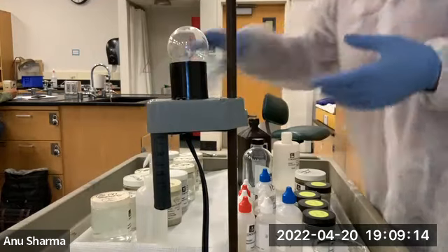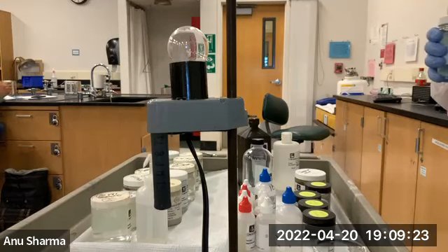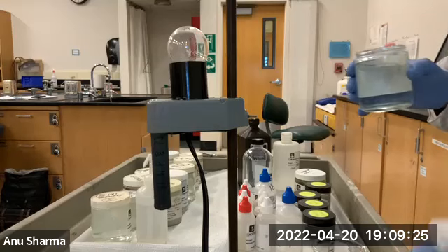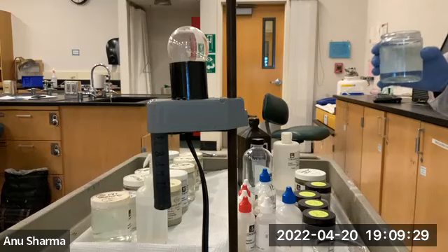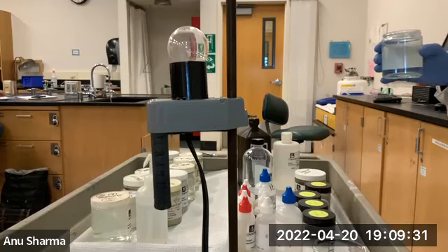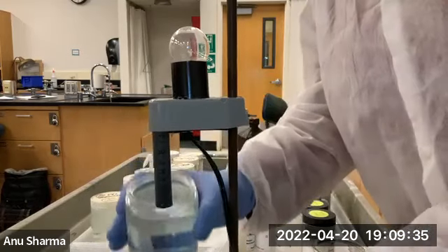Now the second one is the tap water. Now tap water can contain some minor impurities or whatever they put to clean the tap water. It depends where, like for example, if you go to Santa Cruz, or if you go to Pittsburgh, the tap water also has a taste to it. That means there are some ions. But let's see.